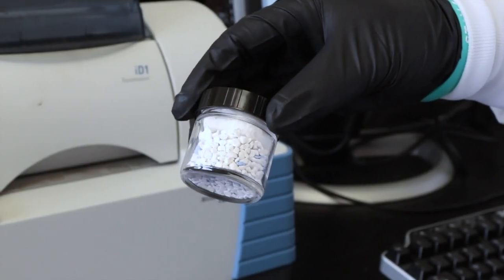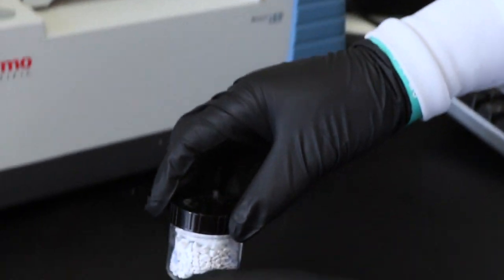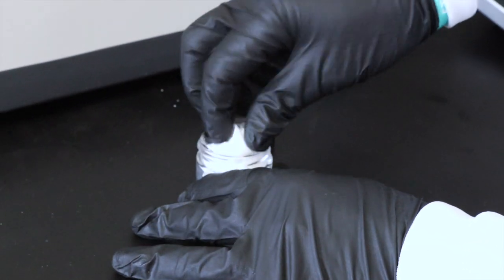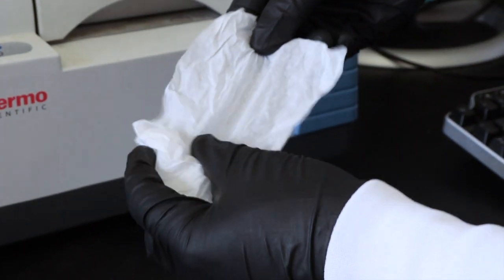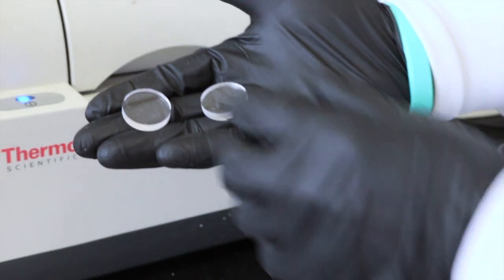We keep the salt plates in a bottle with desiccant salt in it, which absorbs water. We want to do this because the salt plates are obviously made out of salt, and ionic compounds dissolve in water. So if exposed to water for too long, the salt plates will start to dissolve. And then this is what these salt plates actually look like.